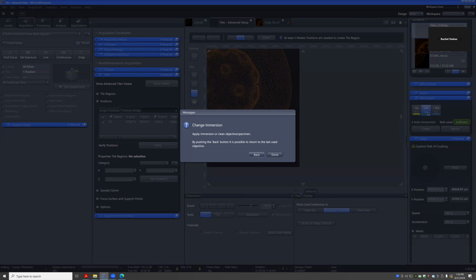We'll do that at the end, because you have to close out of the software and then make that modification. Any hardware configuration change that you make, you don't want to do while the software is on, because it'll get an error, or it'll say it doesn't see the component as we configured it. But if you said the 25 won't have the auto immersion, only the 40 has the auto immersion. Right, the 25 doesn't have it. Yeah, okay.